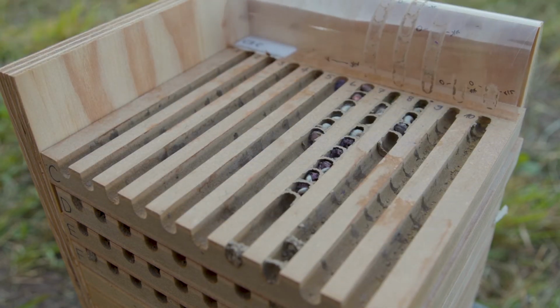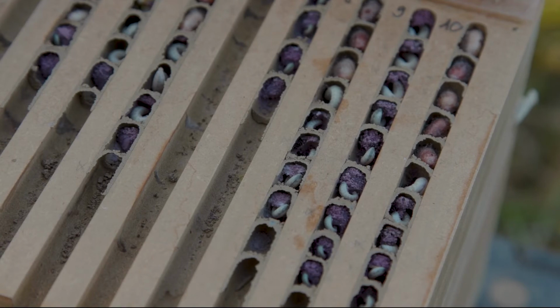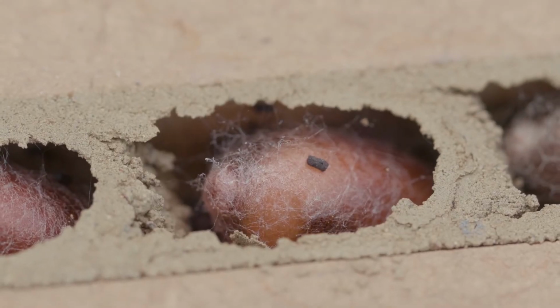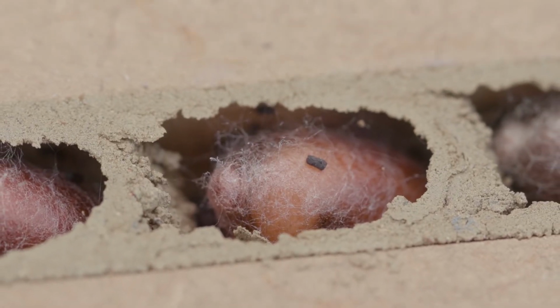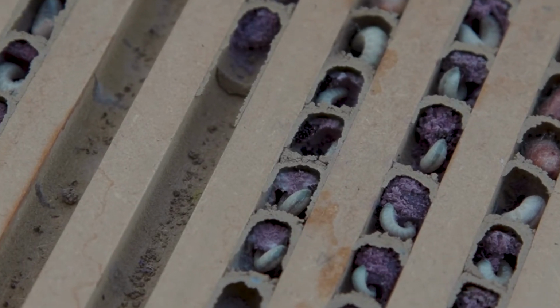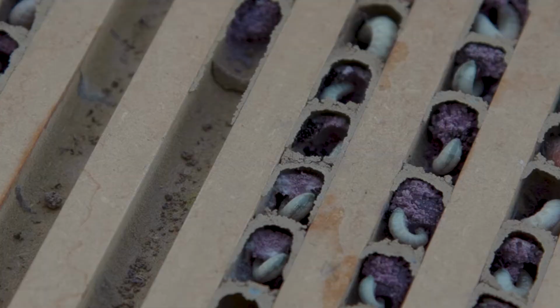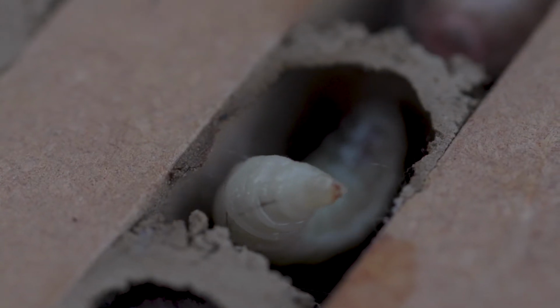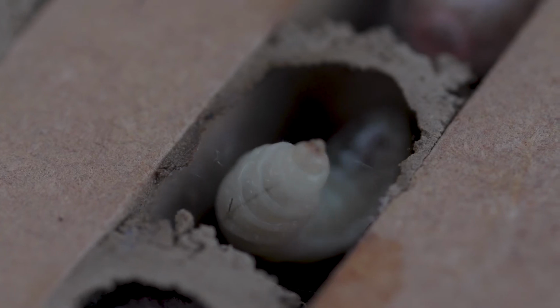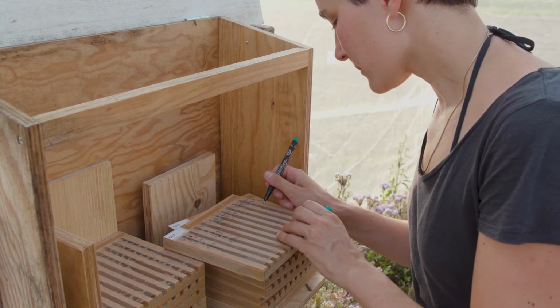To follow the larval development until spinning of the cocoons, we regularly check the nests and record survival and developmental times across instars. To document nesting progress by females, the most recent brood cell can be marked in each nesting cavity before and after the time span of interest. In this experiment, nesting progress is recorded every day during 3 weeks. Even the completeness of the cell can be noted down.